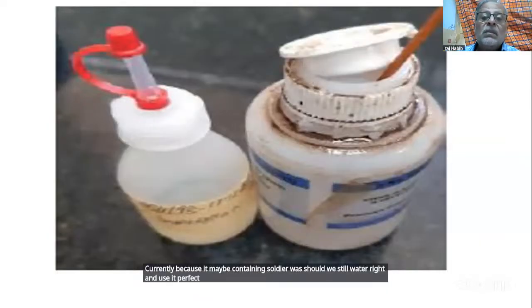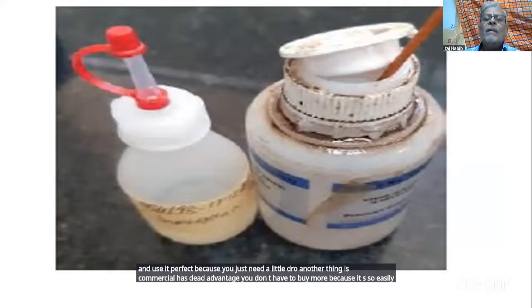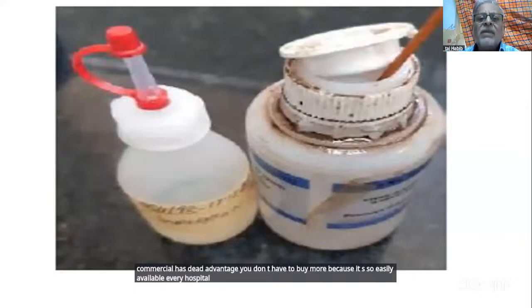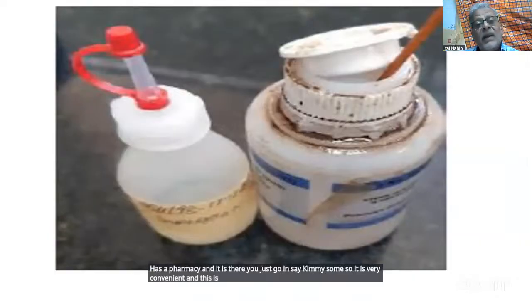Perfect, because you just need a little drop. Another thing is, castor oil has the advantage that you don't have to buy more because it's so easily available. Every hospital has a pharmacy and it is there. You just go and say, give me some. So it is very convenient, verified and tried. Works extremely well.